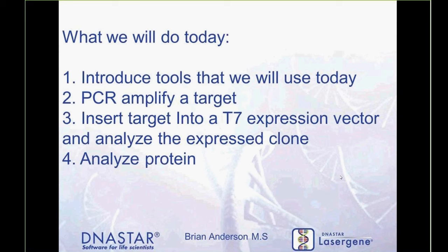To start, I have a very brief PowerPoint presentation that will go through some of the points that we'll be covering today, and then we will go directly into the software to go through the logical workflows. So essentially there are 4 topics that we will be going through today. The first thing I'm going to do is introduce you to some of the tools that you can use for cloning, expression, primer design, and so forth.